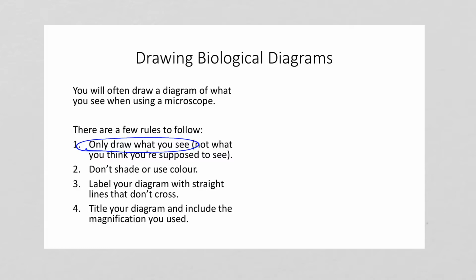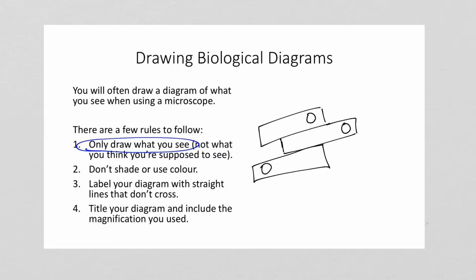A light microscope does not have a very powerful magnification or even resolution, so you're not going to be able to see everything that you think you will. For example, if we were going to do the epidermis of an onion, so just some onion that you've peeled off, really thin layer, and put down on a slide and then stained, you will see something similar to this. And I know that my artistic abilities are second to none. Don't strain yourself trying to draw perfect rectangles like that. You're going to have that. You're going to see a circle, which is the nucleus, and then that's it.